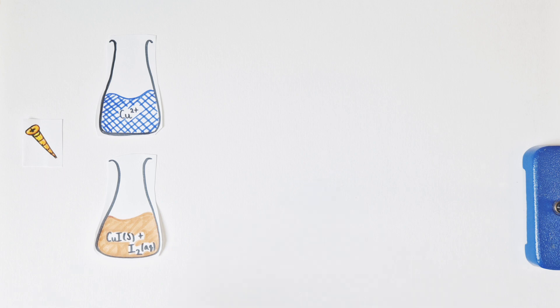That reaction would form copper iodide solid and iodine, and that mixture of a white precipitate and a brown solution would form a murky brown suspension, which is what we're going to then titrate against.